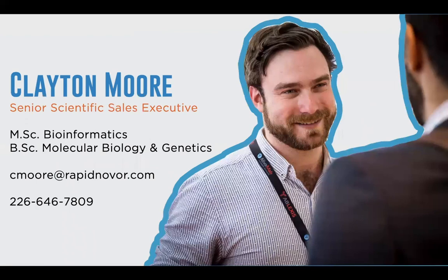All right, Clayton, so it looks like we have our first question: is it possible to characterize polyclonal antibodies? That is an excellent question. And the answer until very, very recently for us would have been maybe, but we just recently developed a commercially available polyclonal sequencing service.